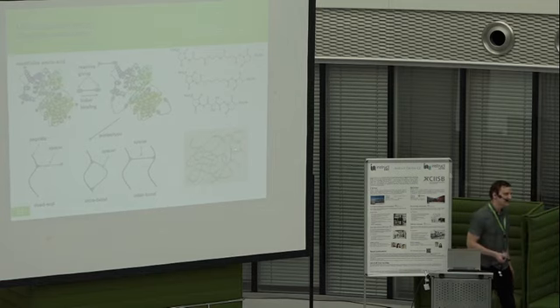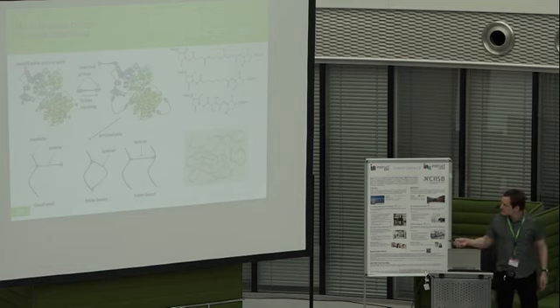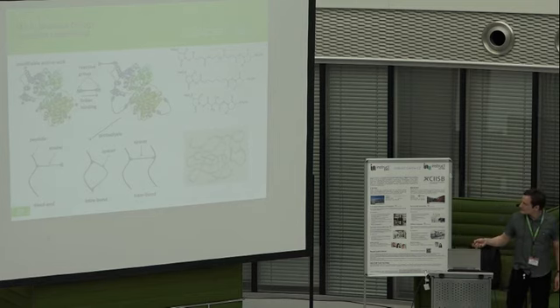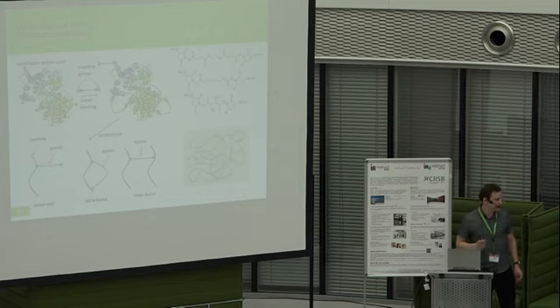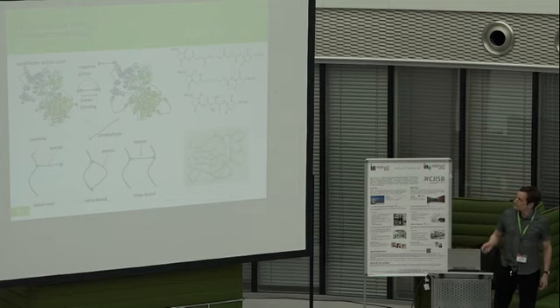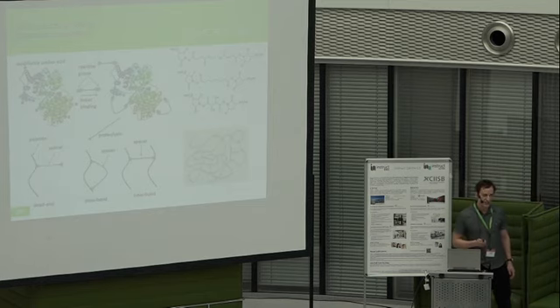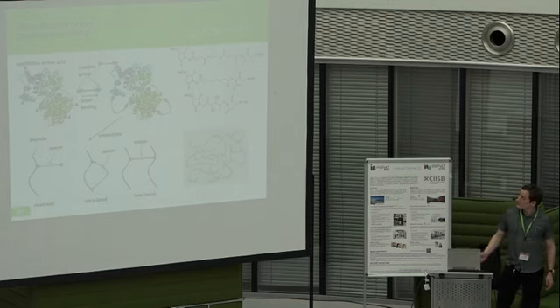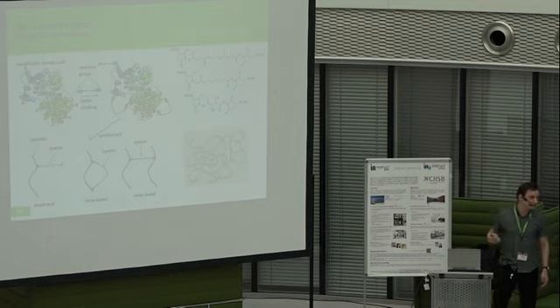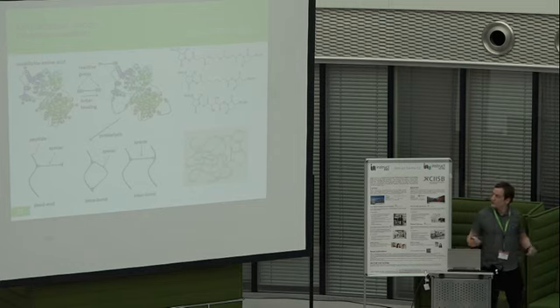Usually at conferences you see big professors showing you this last picture, like the nice result, when they mixed protein and reagent and made a single MS analysis, they obtain this and they are finished. Unfortunately, the true stories are different, because every step of this derivatization or every parameter needs to be optimized, and it must be optimized individually for every combination of protein and reagent, because if you let it overreact, you then obtain a lot of crosslinks, but again, they will be on an artificial, denatured protein. They will not reflect the native state.